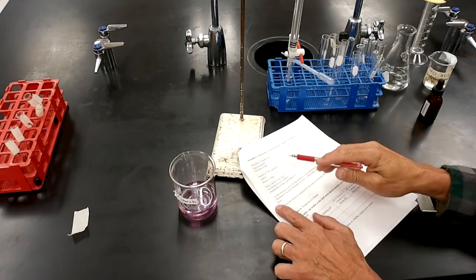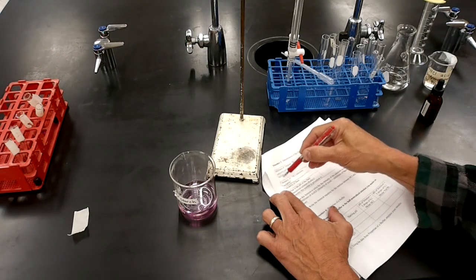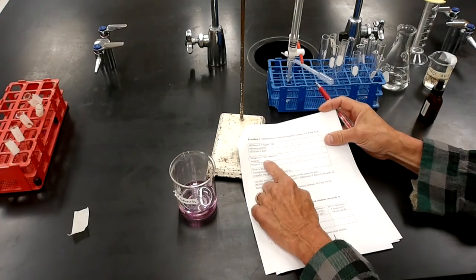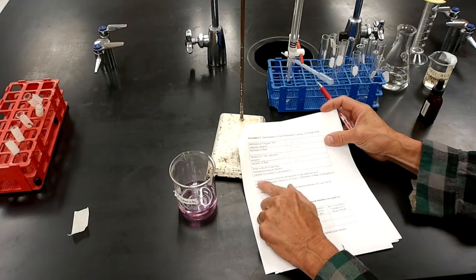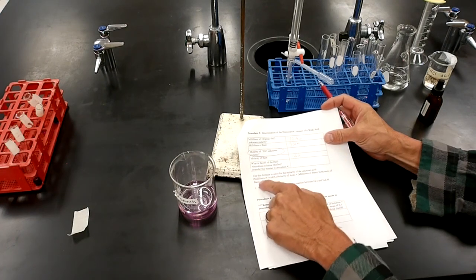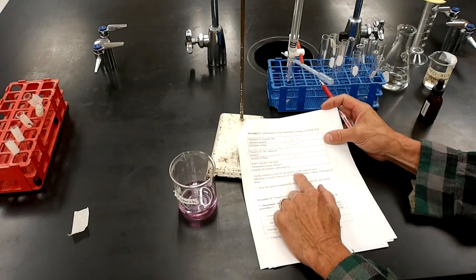So I'm going to plug it into an equation, and what I'm trying to find is this right here. This is what you'll have to find: the molarity of the unknown hydrochloric acid solution. So the equation is down here. You'll plug these numbers into this equation. It says use this formula to solve for the molarity of the unknown acid.